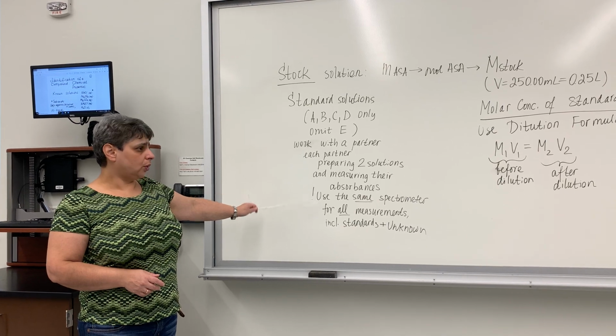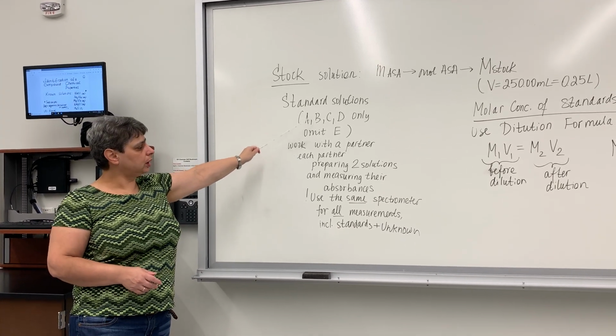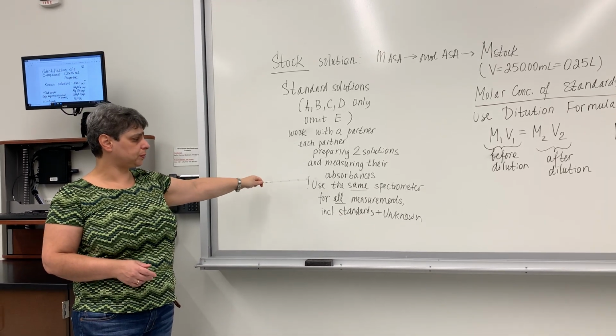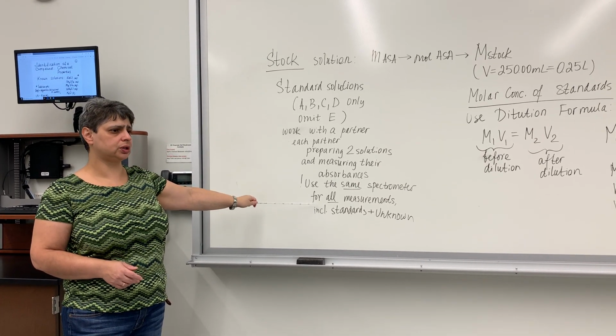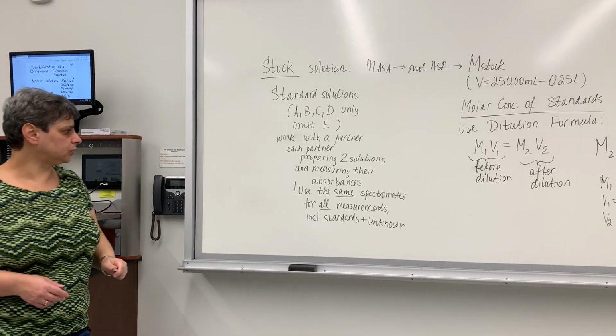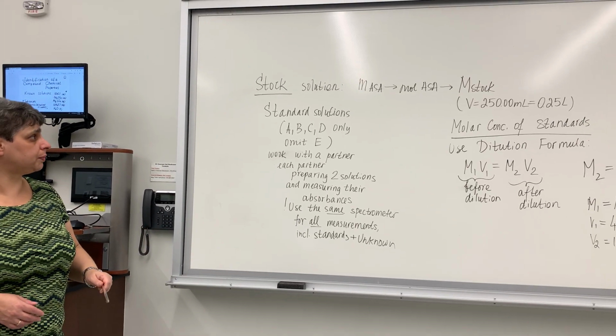I'd like to point out that all of the solutions, all 4, must be measured for absorbance using the same spectrometer. So make sure you coordinate with each other as to which spectrometer you're going to be using. There will be several set up around the lab.